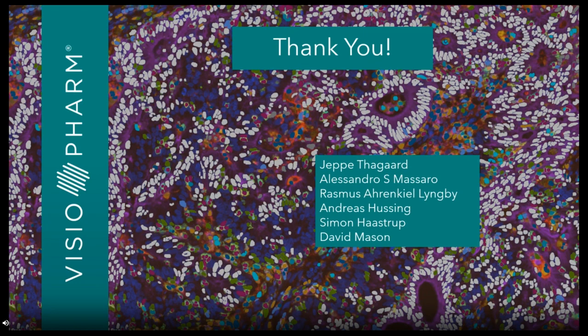Yes, so now I'm back. My internet connectivity here at my holiday site is very bad. I'm sorry for that. Yes, the Phenograph module is on the market, and this is an automated clustering using a Gaussian mixture model. And we are currently working on updating that in the future.